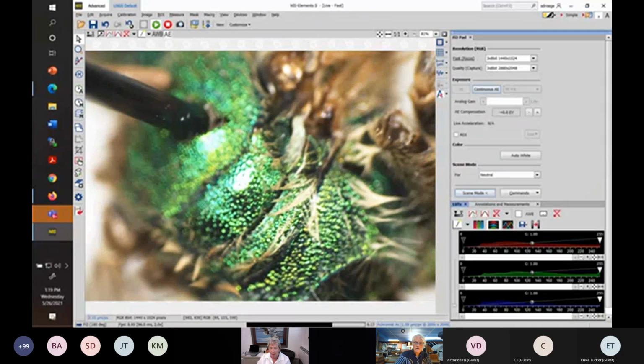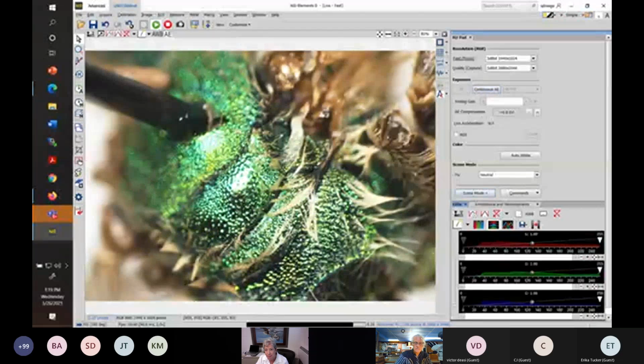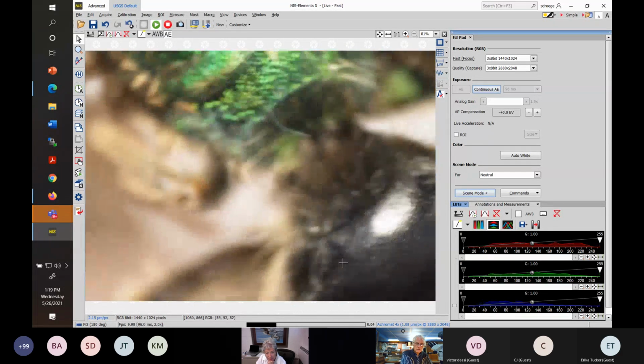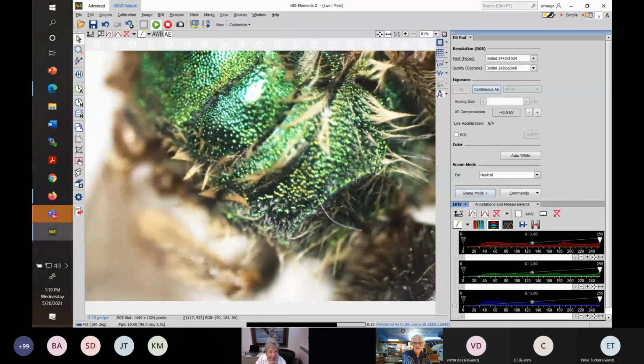And next one after is the propodeum. The propodeum has a dorsal surface, and sometimes we call this the dorsal triangle up here, and it has a rear face. Sometimes it's a smooth transition, but in Agapostemon there is, let me show this a little bit better, this magical raised line, usually described as a carina in the technical literature.